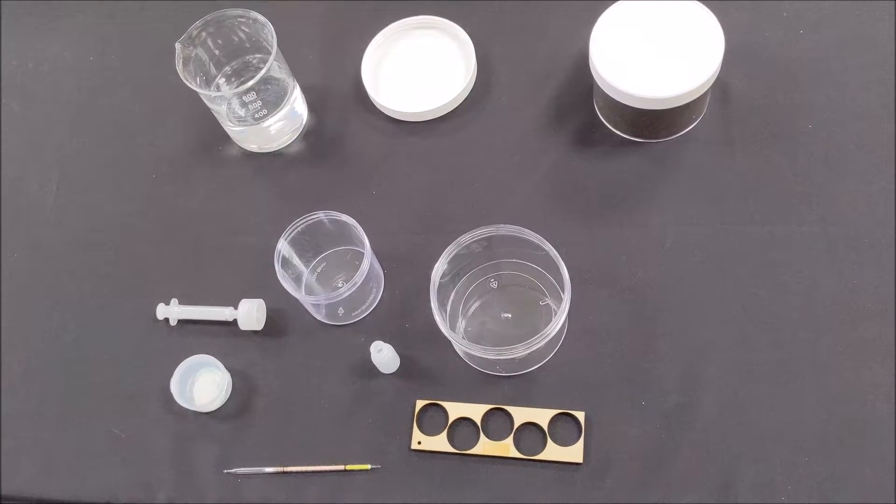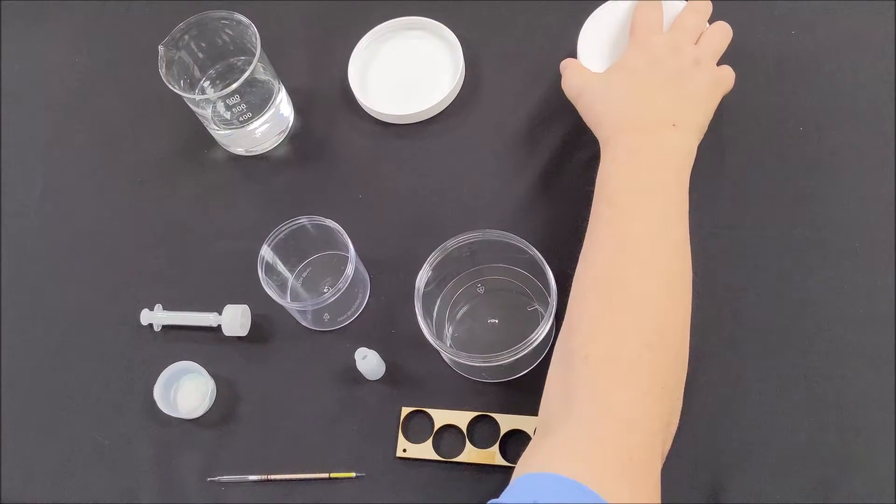Rinse the jars and containers with reagent water until clean. DI or distilled water from the drugstore or supermarket will suffice.